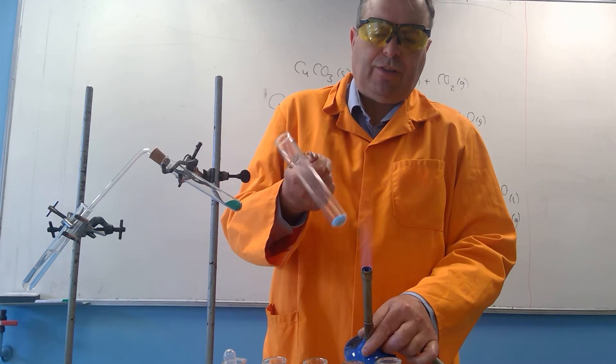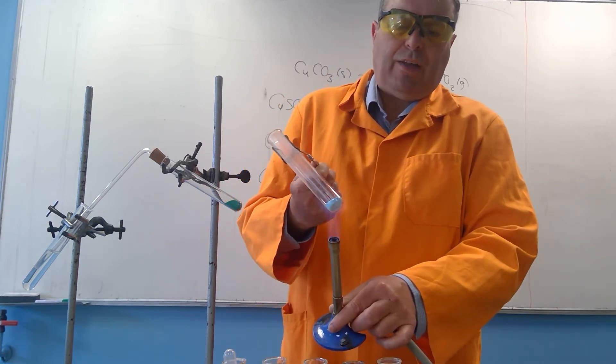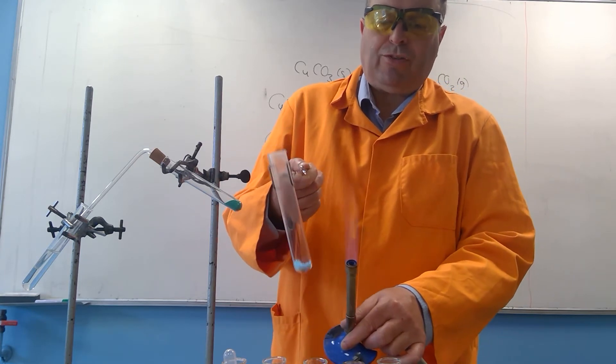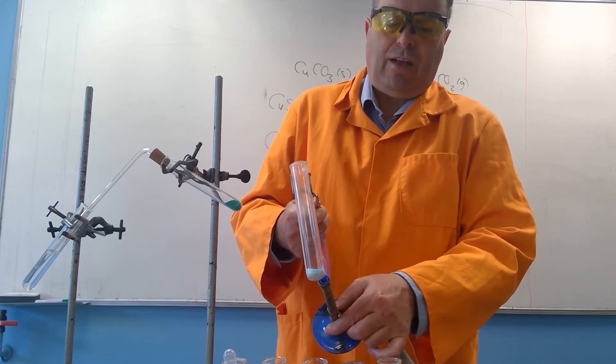Give a little shake around, and you can probably see by now that the bottom of the tube, the chemical has gone from blue to white. It takes a lot longer to get the top side to go because the heat's not quite getting there yet.